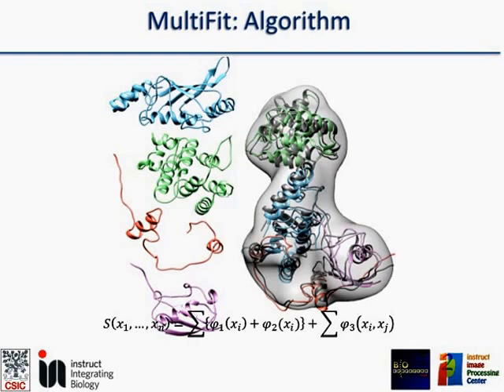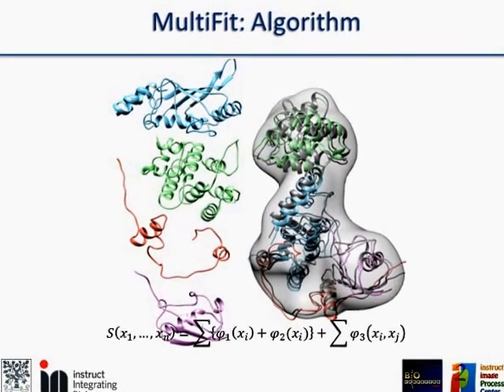So finally, what we are seeing here is probably the best structure after the docking process. For that reason, multifit can produce very close results, or at least results that make a lot of sense from a physical point of view.